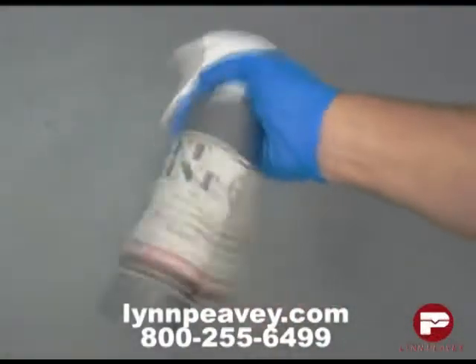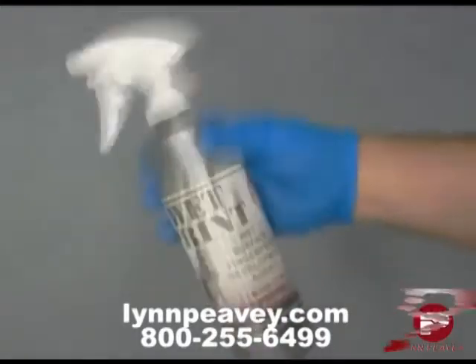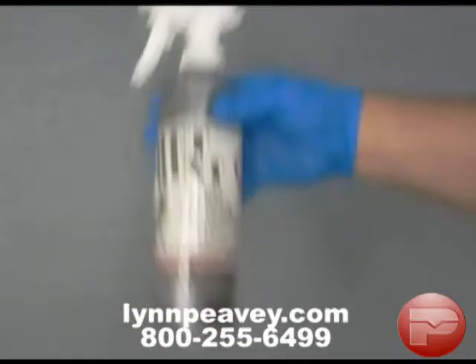With the spray nozzle in the off position, shake the Wet Print reagent vigorously before and during the application, because the small particles contained in the solution settle quickly to the bottom.